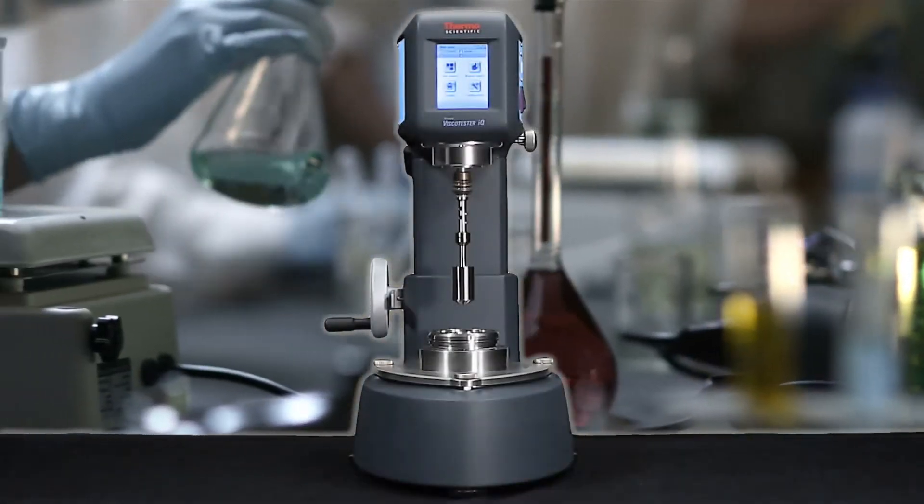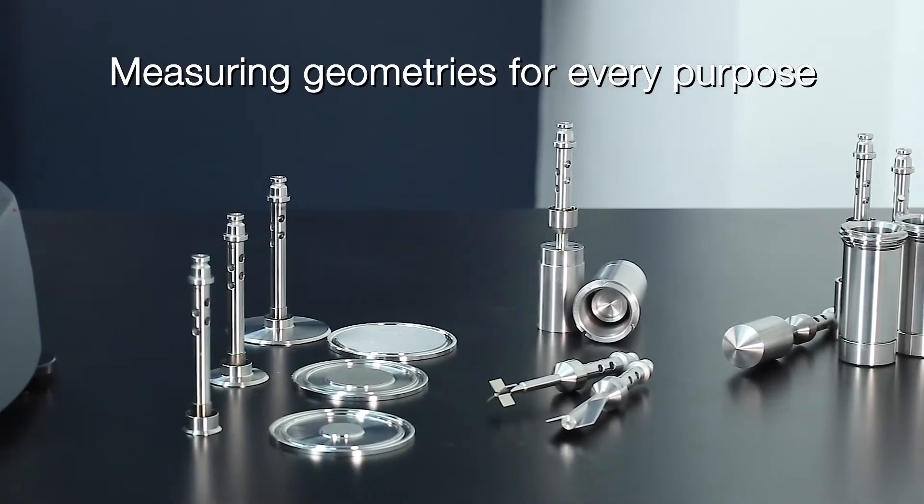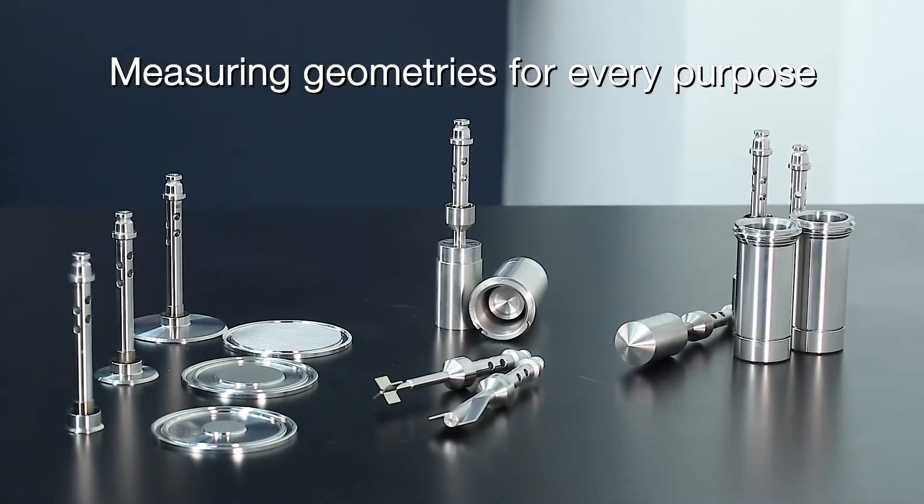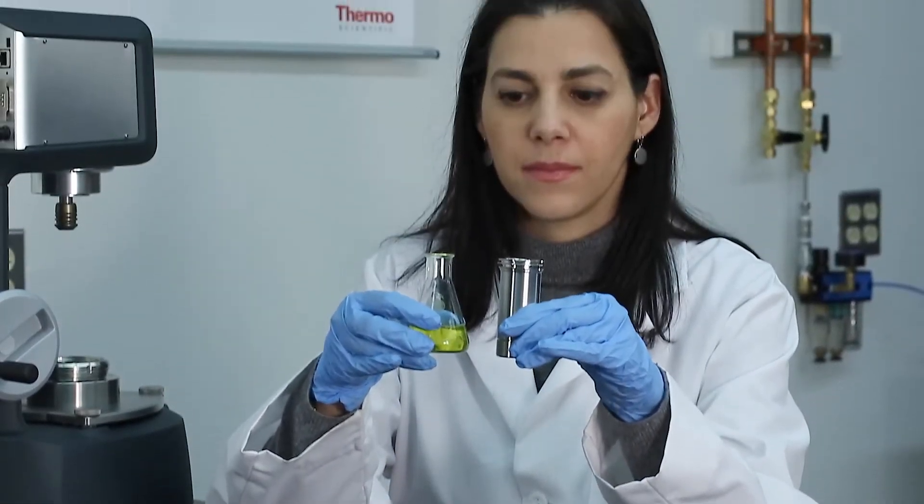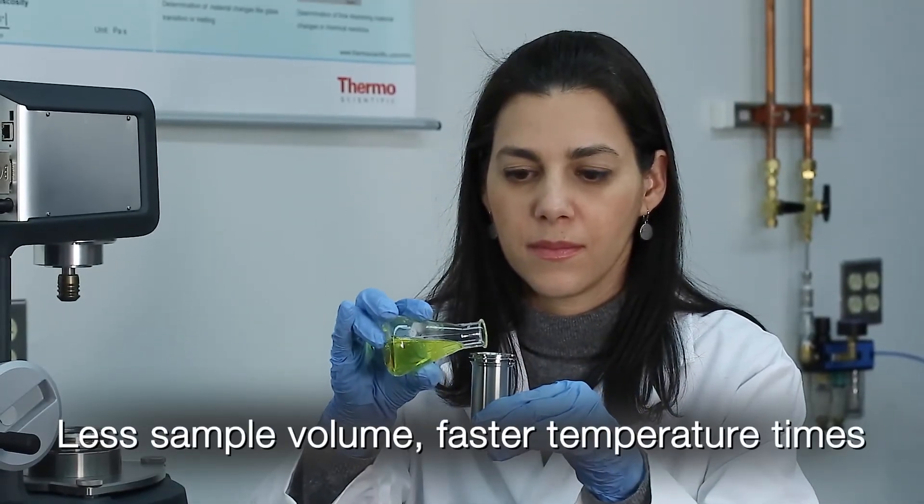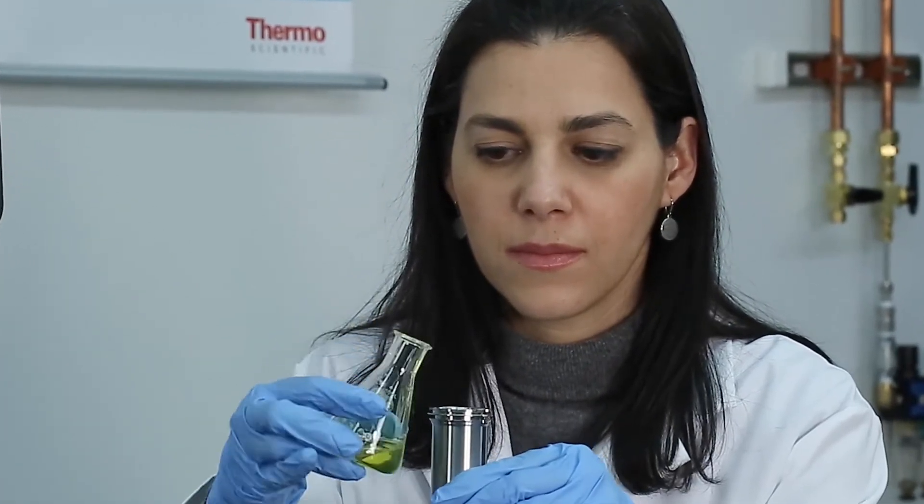The Haake ViscotesterIQ rheometer comes with a full range of measuring geometries, each designed for optimal handling and easy exchange. Thanks to small-sized coaxial cylinders, you use less sample volume and have shorter temperature equilibrium times, minimizing your cost per measurement.